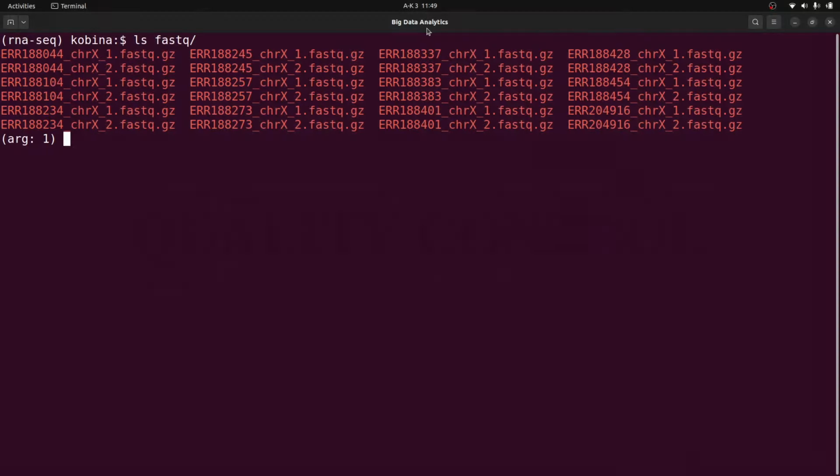to assess the quality and see if everything is okay with what we have so far. So that's what we are going to proceed with. So to do the QC, what we are going to do is to run FastQC first, and then we will run MultiQC. All right, so these are the two things we are going to do. So FastQC to get us the initial report, and we will aggregate everything using MultiQC.